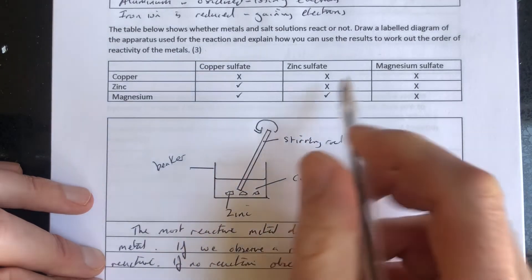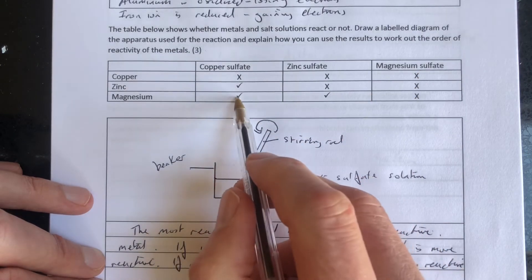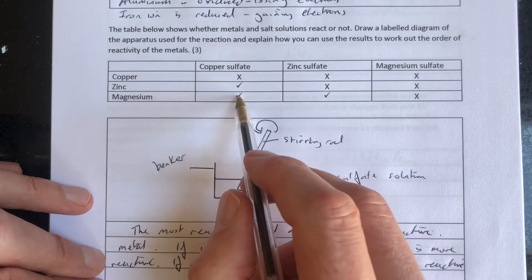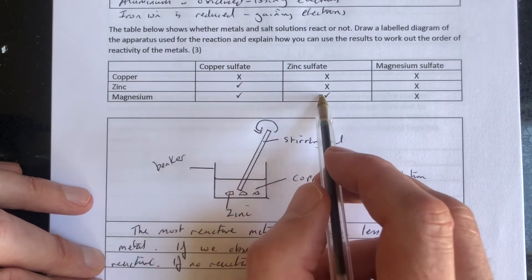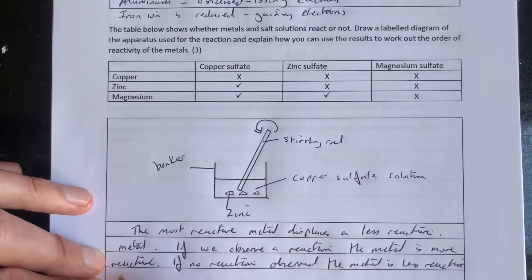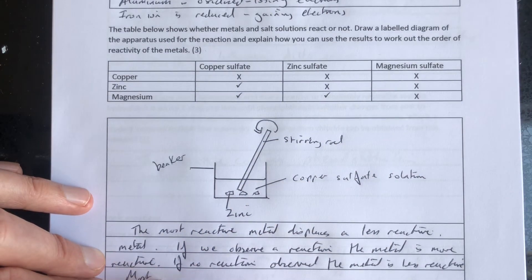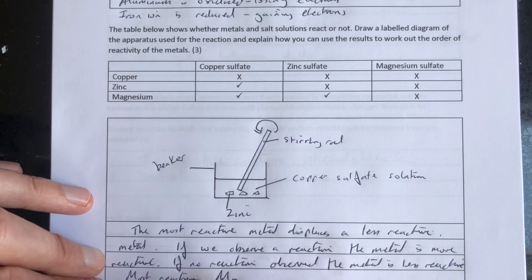So looking at these results here, magnesium reacts with copper sulphate. It reacts with zinc sulphate. Therefore, magnesium is more reactive than copper and more reactive than zinc. So most reactive: magnesium, number one.